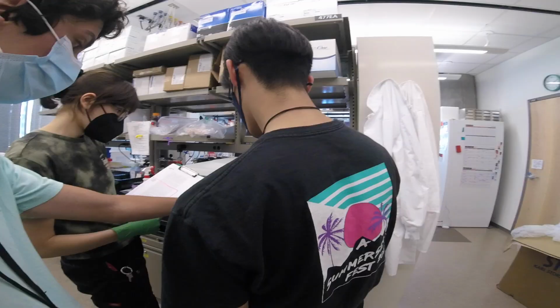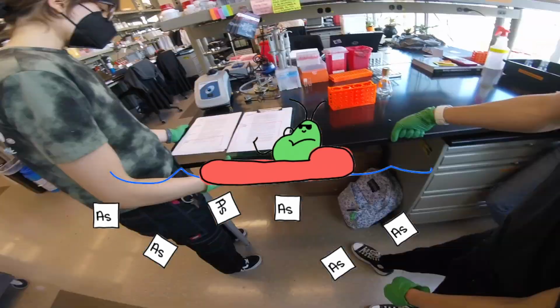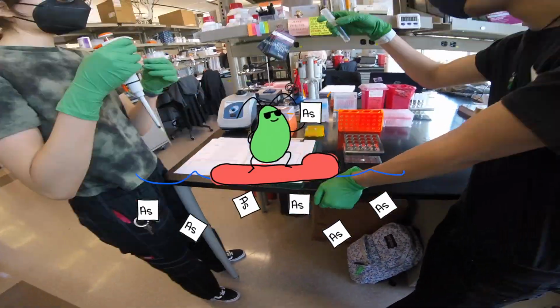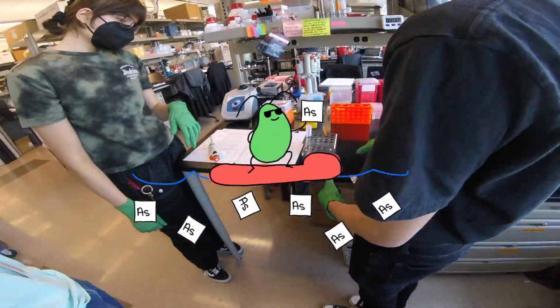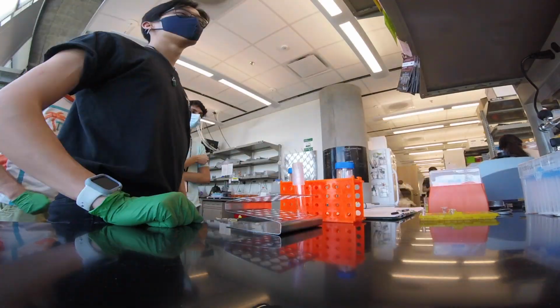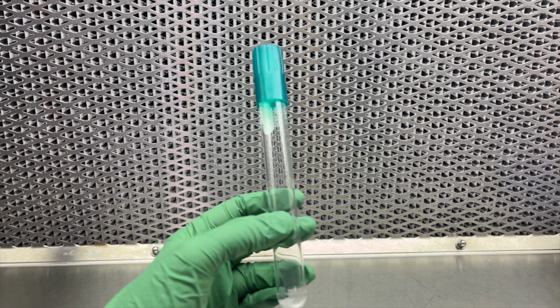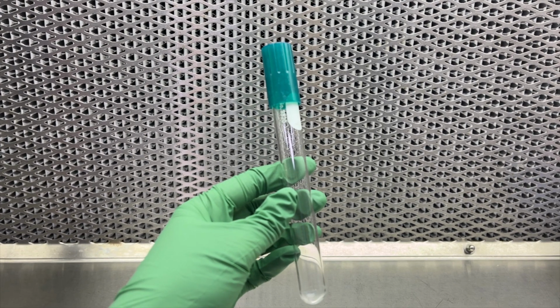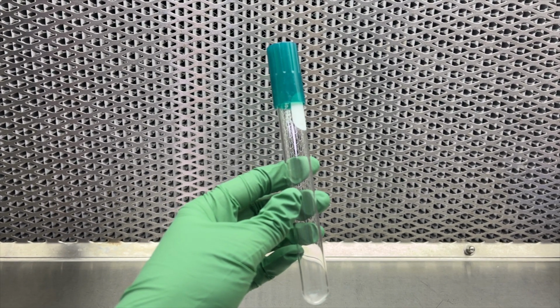Our team's goal is to develop a solution that takes advantage of C. reinhardtii's natural metal-binding abilities to remediate these water sources in a way that's efficient and non-disruptive to the surrounding environment. To genetically engineer C. reinhardtii, we use the glass bead transformation method, which has been well documented as being successful in transforming genes into the C. reinhardtii nuclear genome. Multiple variations of this protocol exist in the literature, but the protocol below is a mixture of two protocols that gave our team many transformants.